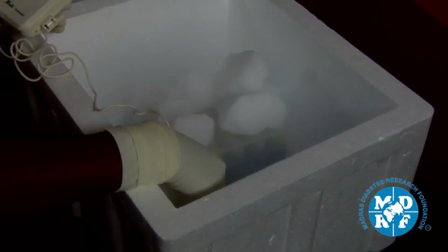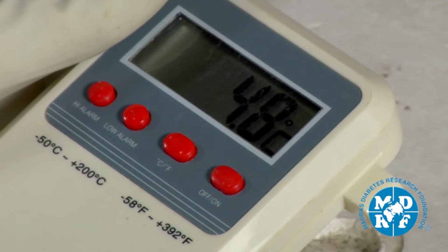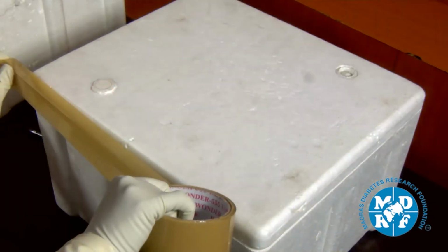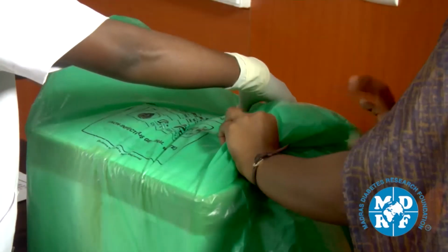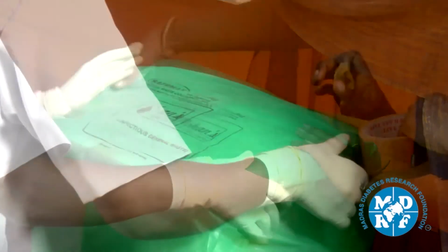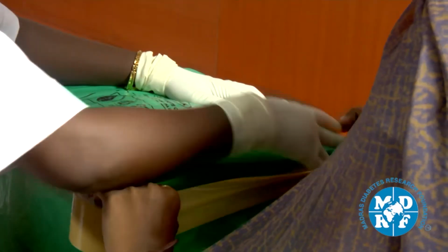The core temperature of the box should be then determined prior to sealing the box. The temperature of the box must be maintained between 2 to 8 degrees centigrade at all times. Document the temperature of the box and seal the box tightly with brown tape. Pack the box in a disposable cover and seal it with tape so that the cooling is maintained.